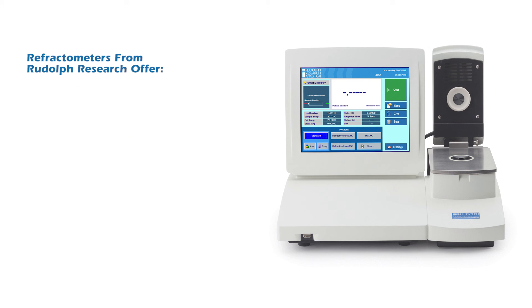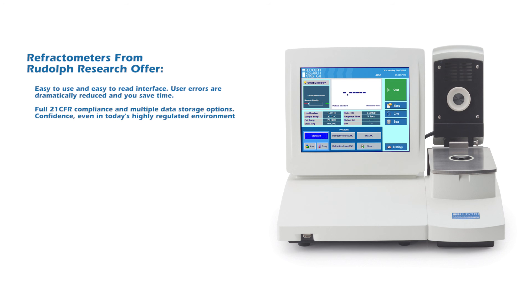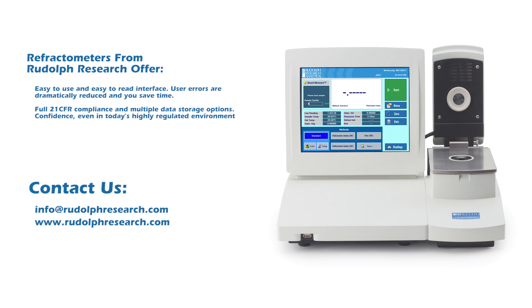Refractometers from Rudolph Research offer an easy-to-use and easy-to-read interface, dramatically reducing user errors and saving time. Full 21 CFR compliance and multiple data storage options give you confidence even in today's highly regulated environment. Contact Rudolph Research for assistance in selecting a refractometer model for your application — one of our specialists will be pleased to help you.